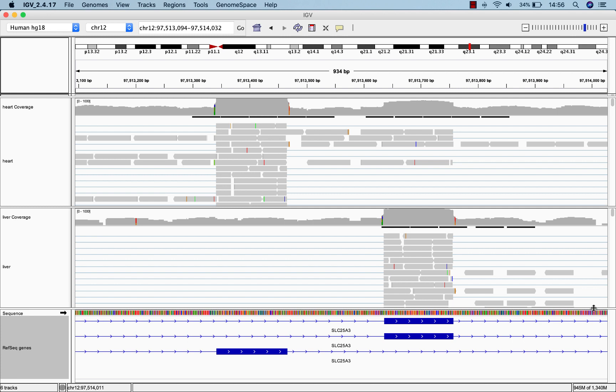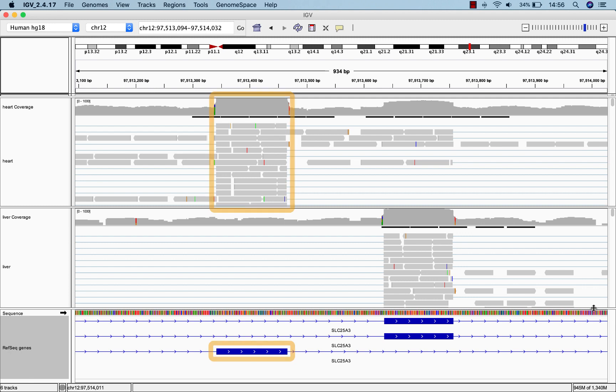This phosphate transfer gene has three different isoforms due to alternative splicing. It seems heart and liver are expressing these isoforms differently. For example, heart is expressing the third isoform significantly more than liver. This is an important biological distinction that is easily visualized in IGV.